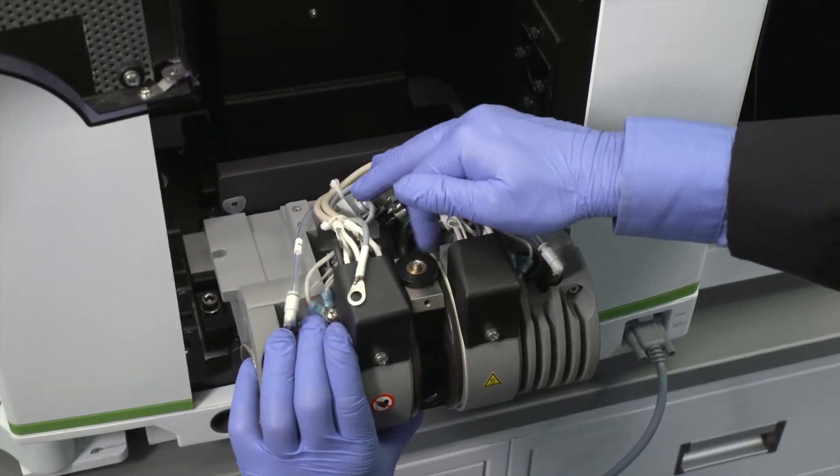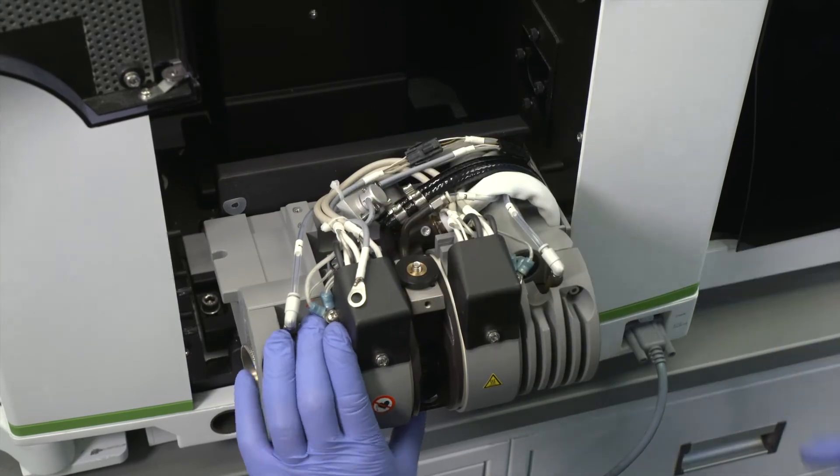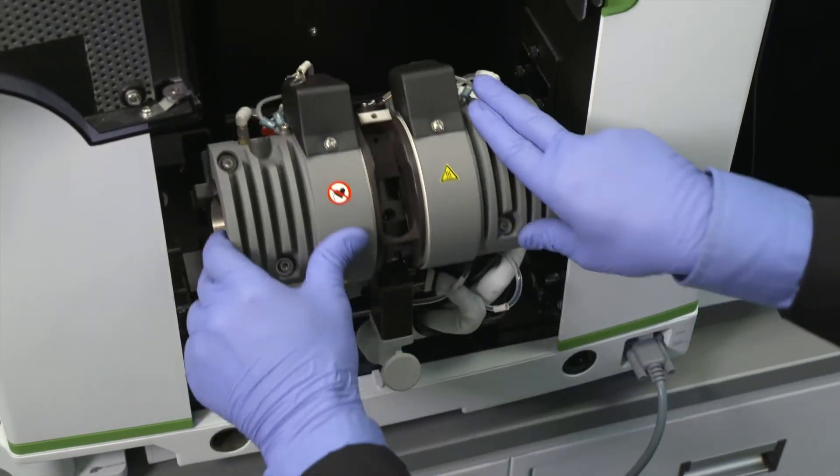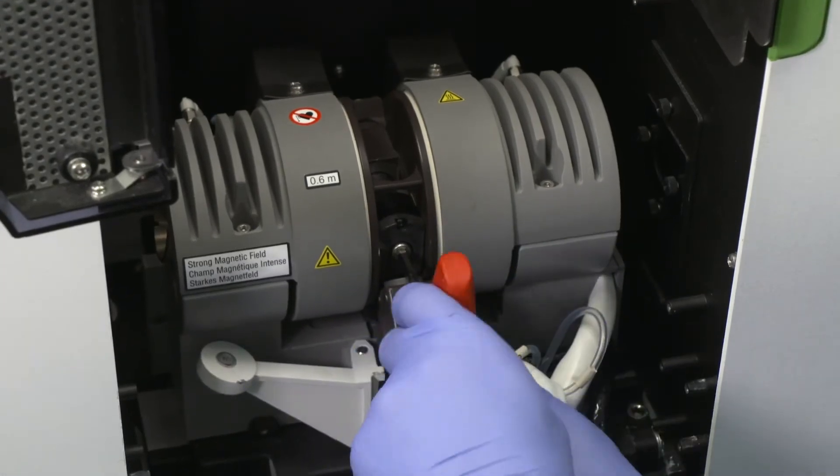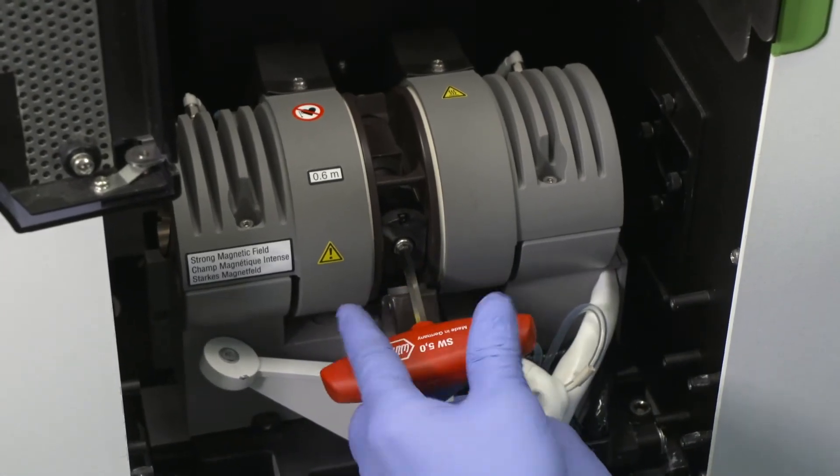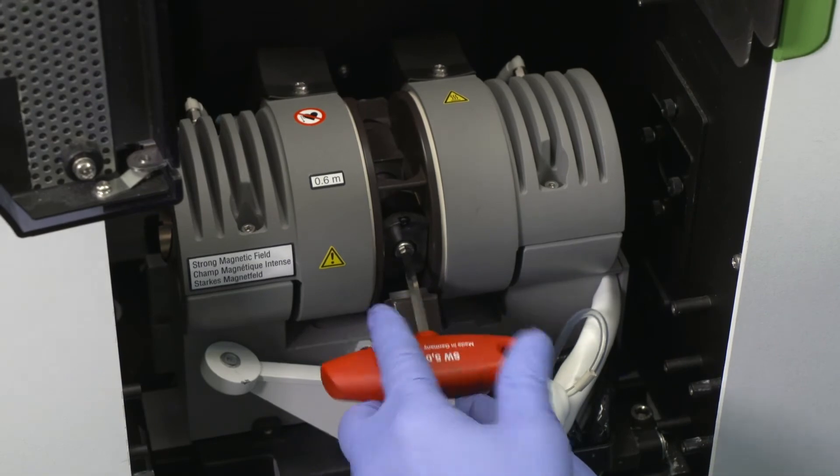Again, ensure the dosing hole is at the top. Tilt the graphite furnace back into its original position. Then use the hex driver to screw the bolt into the threaded cylinder. Push the contact into the contact housing.